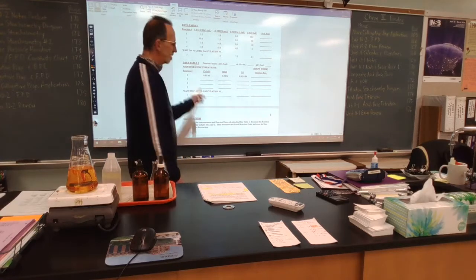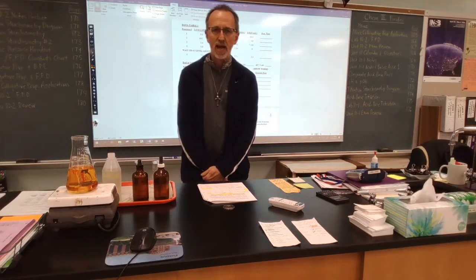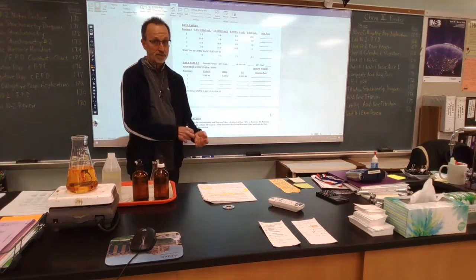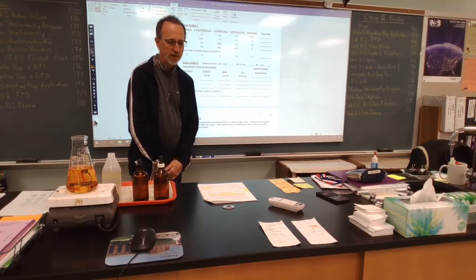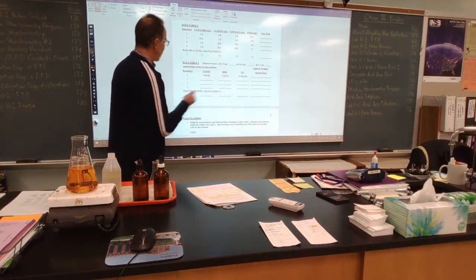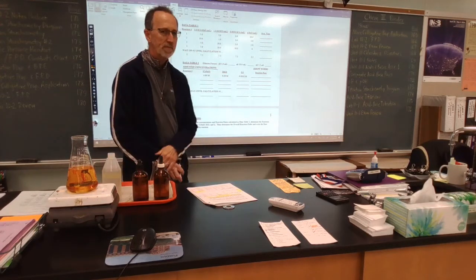Go down to the data table because we determine reaction orders using concentrations. So remember, we want concentrations. This table adjusts the data to concentrations. Here's what I mean by that.